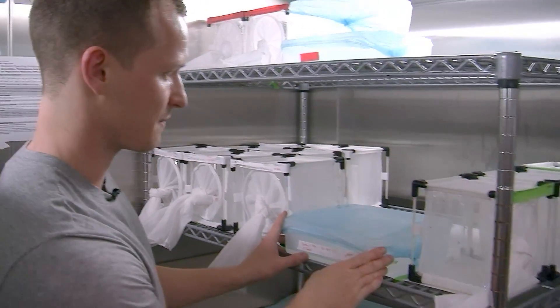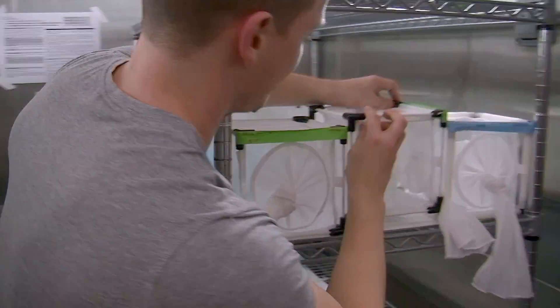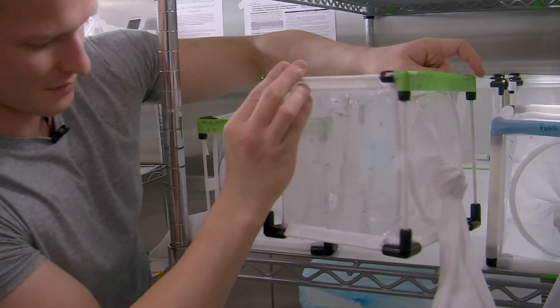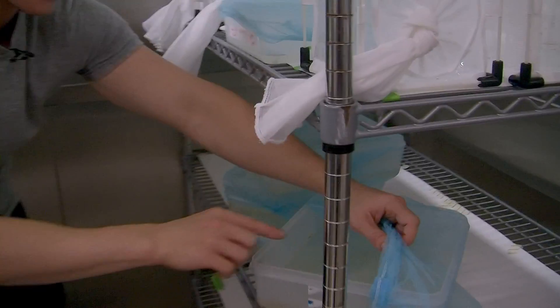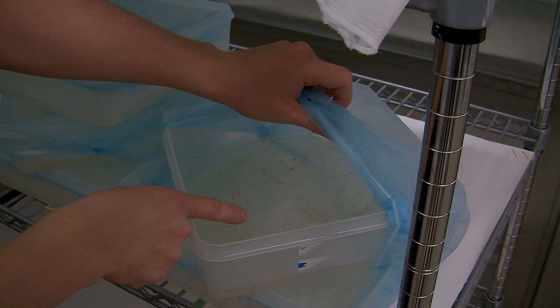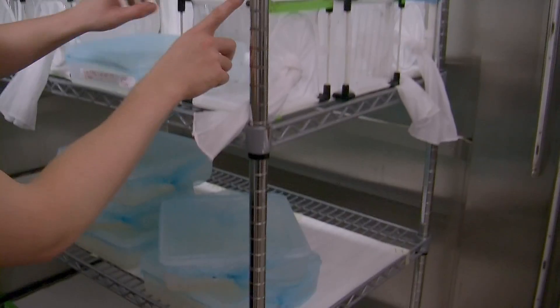Eventually they reach the pupal stage. You can see we have pupae here — these small ones which are bouncing around like little balls. These ones are the last stage of the larvae, and once they're ready, they're going to emerge as adults, and we have the adults here.